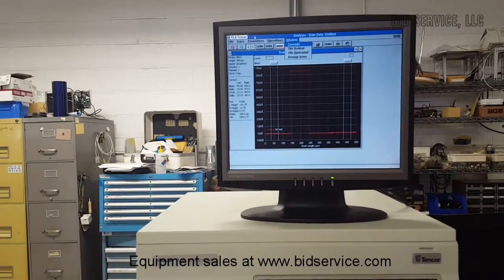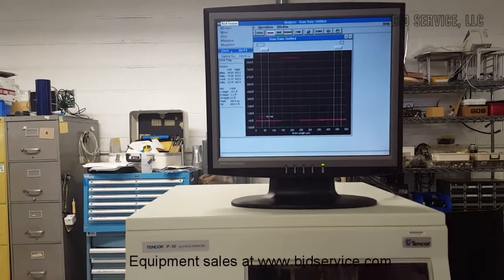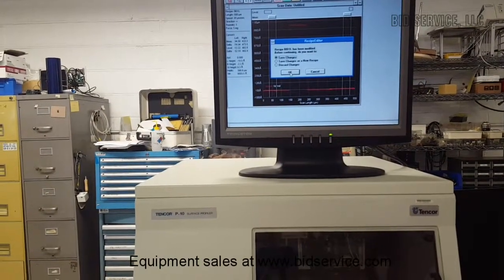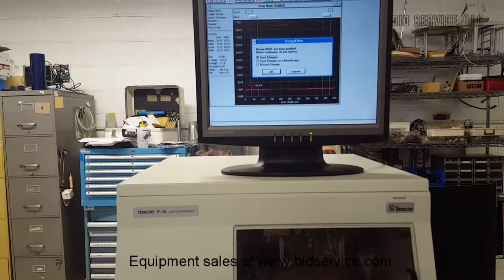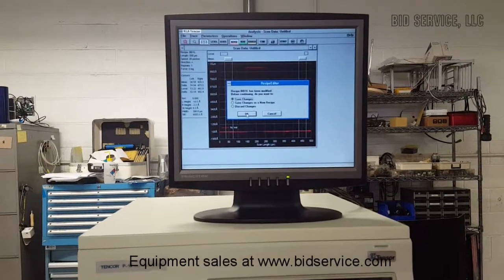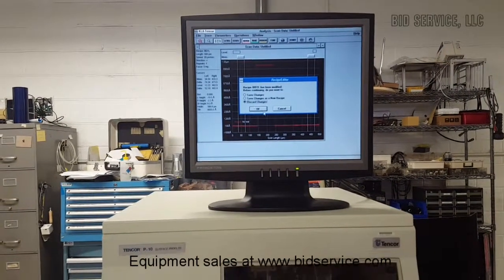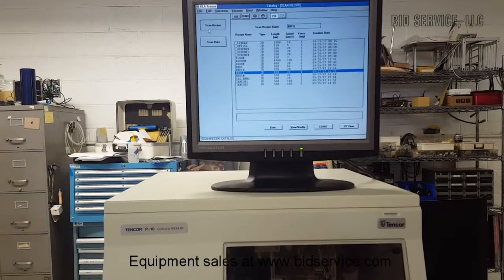So at any point of time, this system software should not be upgraded unless the manufacturer is helping to do so, because changing the software or any hardware on the computer will cause various interface problems.